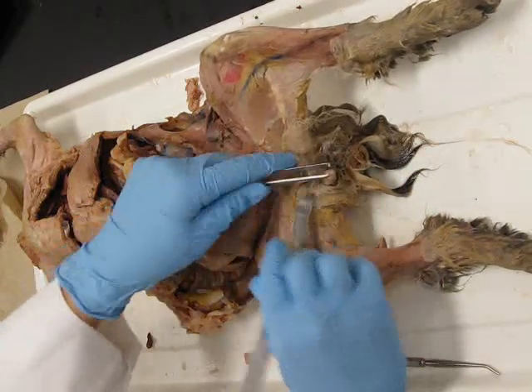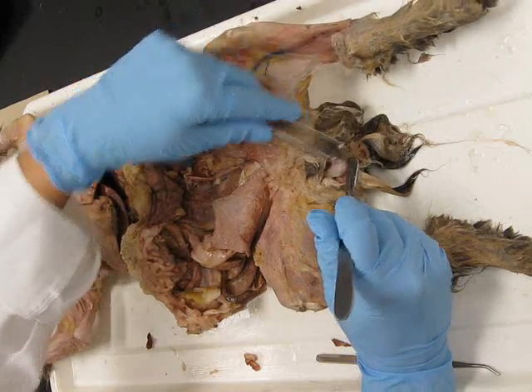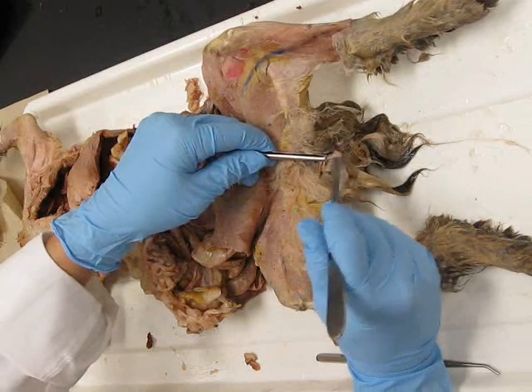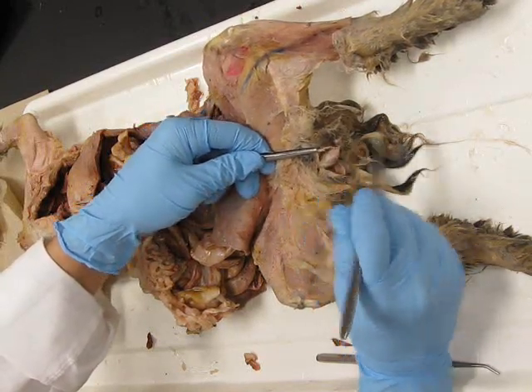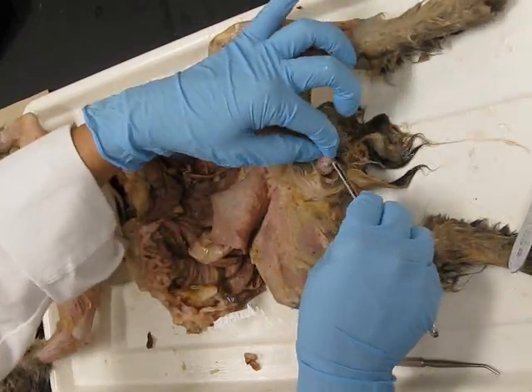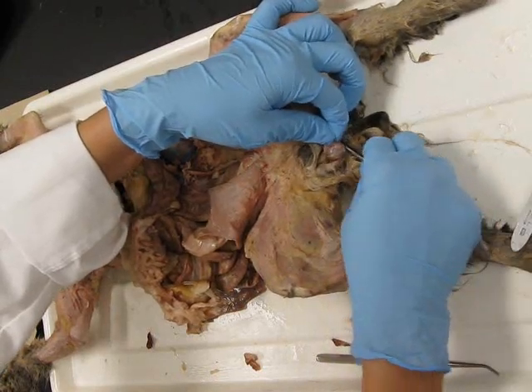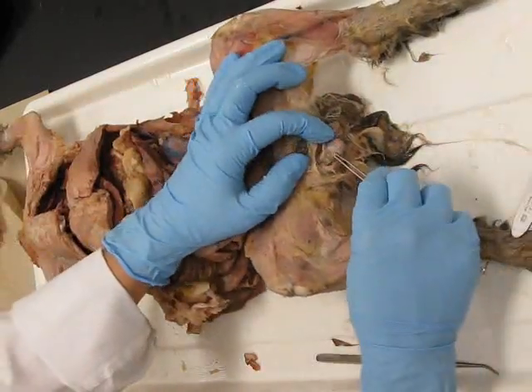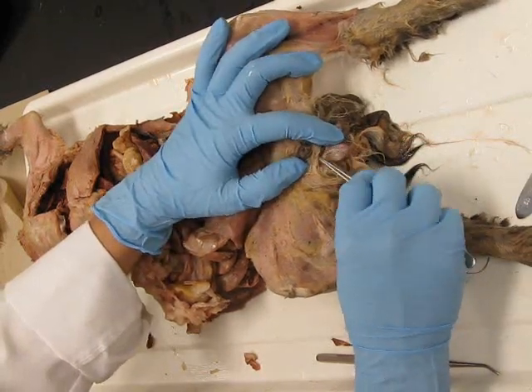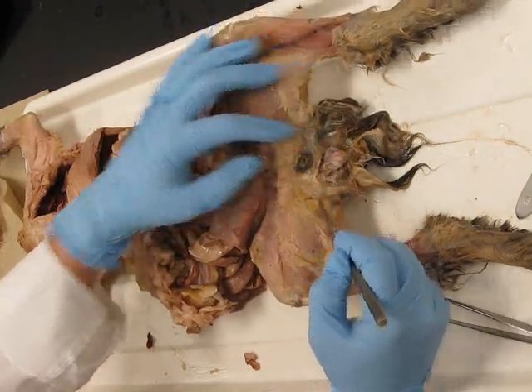Then what you're going to do is make an incision on the surface of the testis. Very light incision, you don't want to go halfway through it, just to get the outer tunica vaginalis and that fascia off. So once you have your incision, you just kind of unwrap the testis from that tissue. Now you can see the testis and the epididymis, this coil along it right here, epididymis. Testis. Okay.